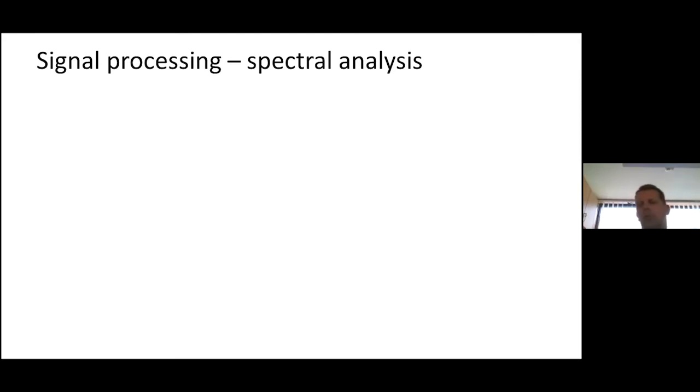We are using so-called pulsed NMR. So we are using short pulses to excite nuclei. We select a certain Larmor frequency for a certain nuclear type. For example, if we want to observe the part of the spectrum which belongs to carbon nuclei, we select 150 and something megahertz in our case as a radiation frequency. We use a short pulse, and with this short pulse we excite a certain spectral width around the excitation frequency, and then we monitor the response of nuclei.